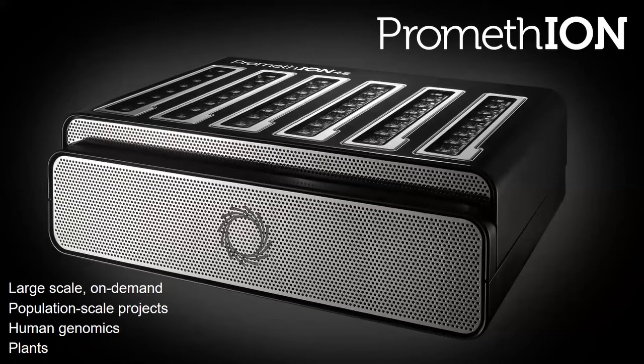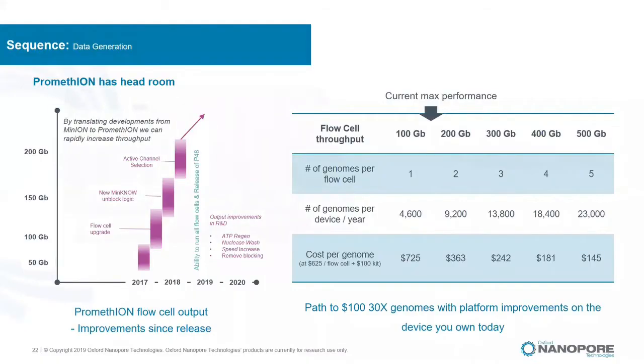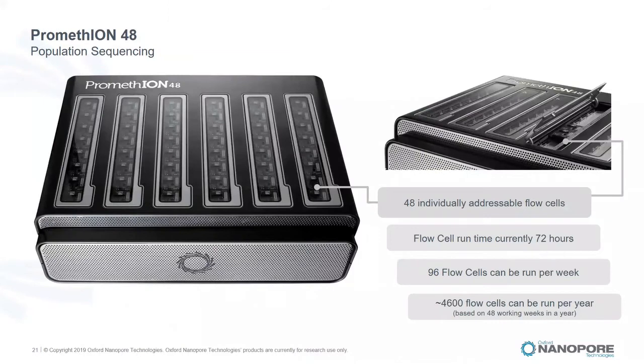You can sequence using 48 flow cells on the PromethION. Each flow cell has roughly 6 times more nanopores than a MinION flow cell. So from one flow cell, you can expect 50 to 150 gigabases. The 150 gigabase is a good result, and 160 gigabase is better. And a very good thing about this high throughput is the PromethION's 48 flow cells.